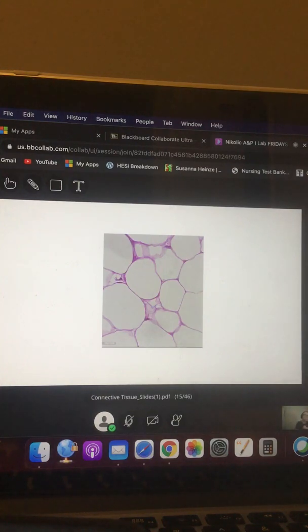Okay, guys, are you ready? Where are we with these questions? Page 40, connective tissue, adipose connective tissue, number 8. What is this? Look at your list. Adipocyte. Yes, adipocyte. I'm not asking for the cell membrane, so don't tell me I can't give you a point. How do you know it's in the list? Awesome. Now, what is this? Look at the list. Tell me what it can be. Again, I don't want to be confusing, so I'm going to make sure that we're not going to confuse fat vacuole with adipocyte. You want to call this the fat vacuole, guys. Don't call it the adipocyte, because otherwise we can't make a distinction if we just put an arrow in the middle. All right, awesome. And again, I'm going to check the exam and make sure that the stuff we talk about is supported in there.